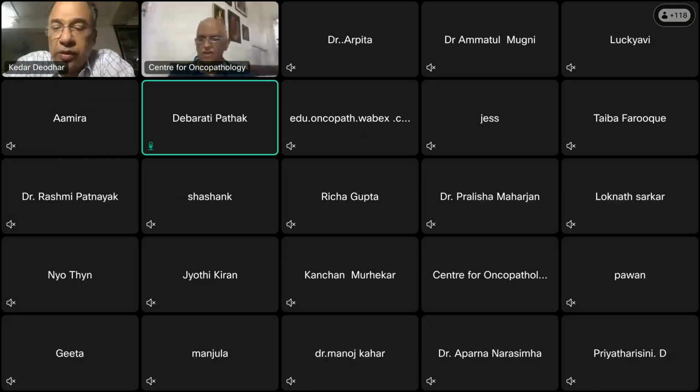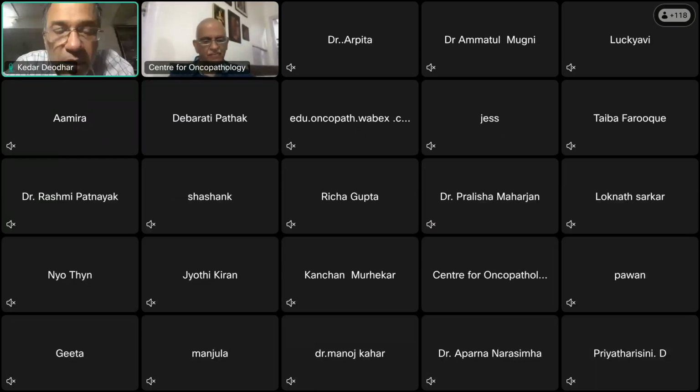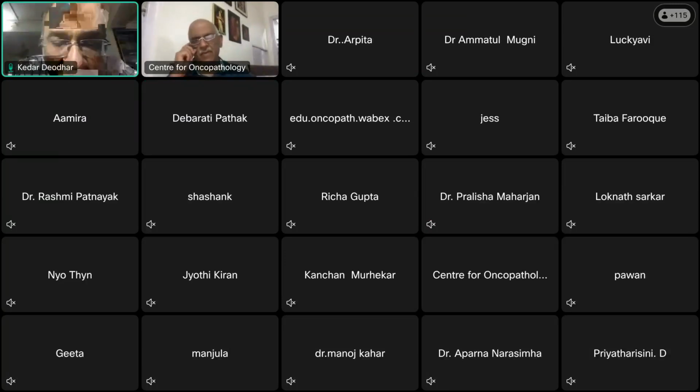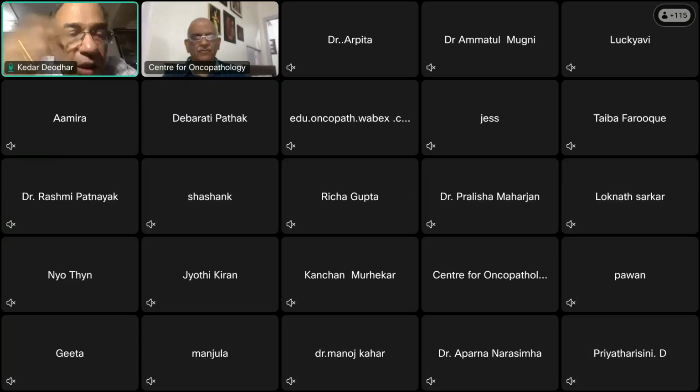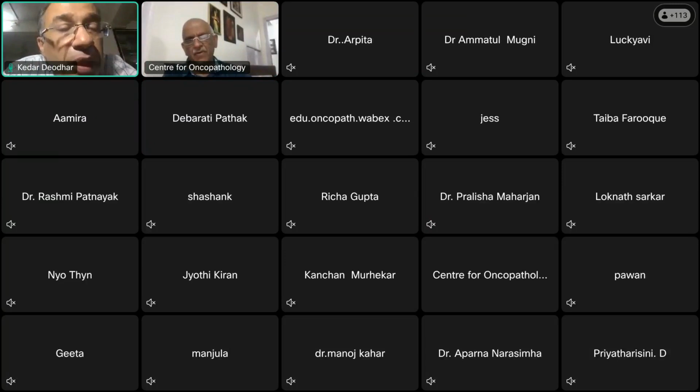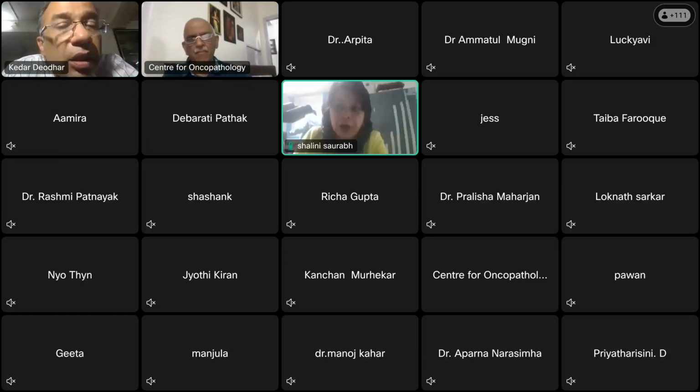So the question is, how do you make out Brunner's gland hyperplasia? So how do we make out Brunner's gland hyperplasia?